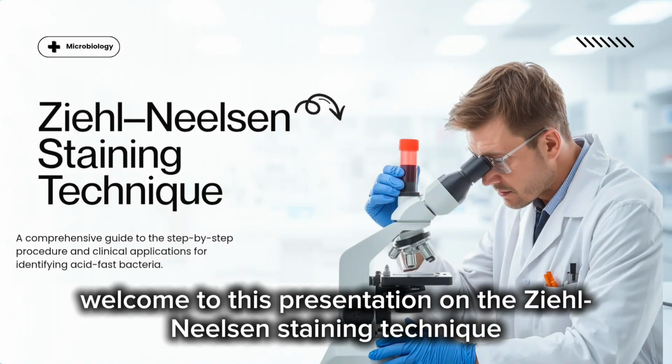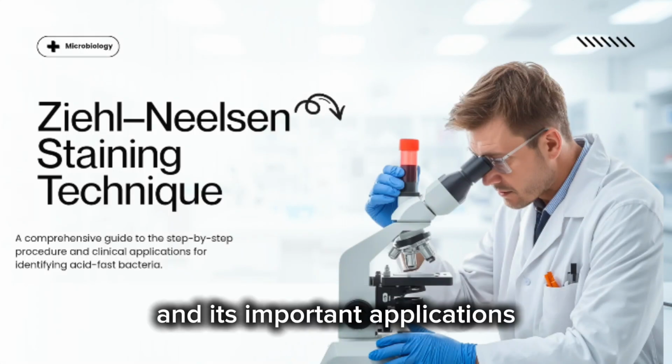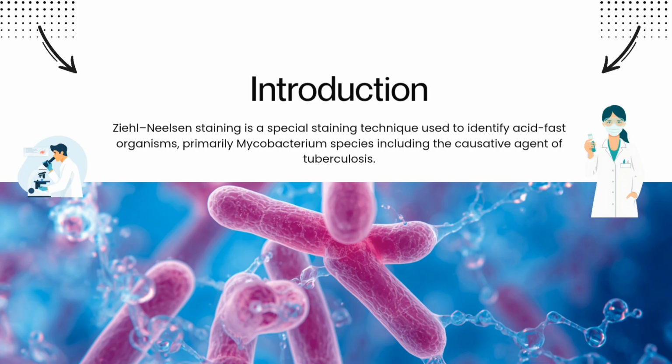Welcome to this presentation on the Ziehl-Neelsen staining technique. In this session, we will go through the step-by-step procedure and its important applications in medical laboratory practice.